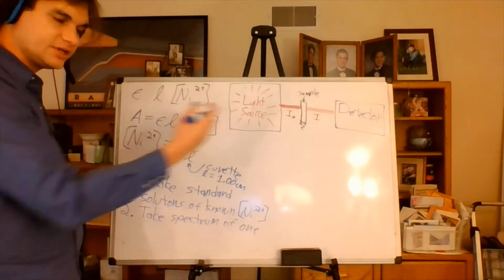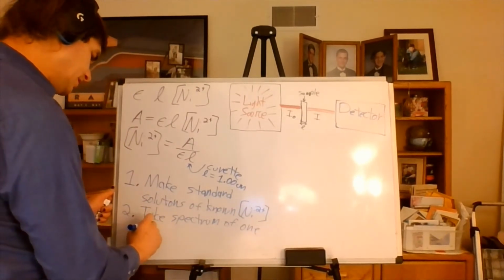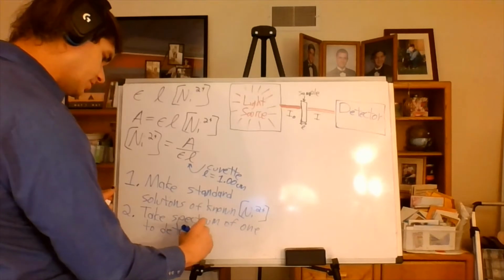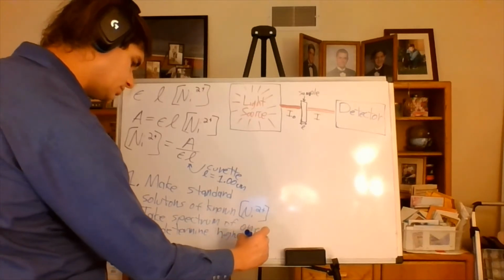We only need to look at the spectrum for one, because what we're looking for is that we need to determine the highest absorbance.